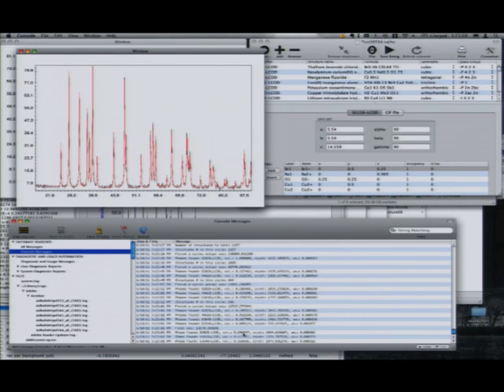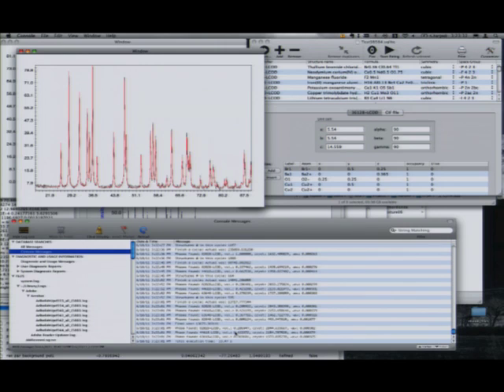Okay, it has finished. Here is the fit. Actually, you get here the phase content, 3 phases. And if I check this one, yes, I know these are the correct phases, so it has identified the phases and done up to the Rietveld fit. And actually, this works also with nano, whatever. Well, I am revising the algorithm testing because the ranking is not straightforward, so I have to test with several. And when it fails, it's just because that phase is not in the database, okay? But in that case, I cannot quantify by Rietveld. So, yeah, that is another problem.